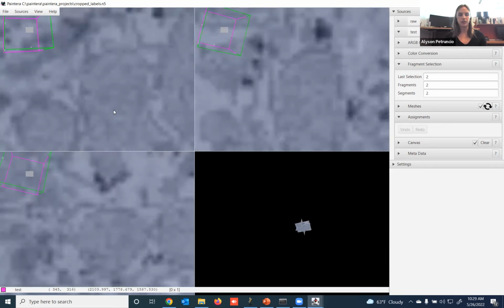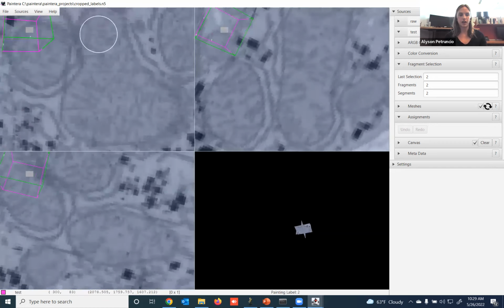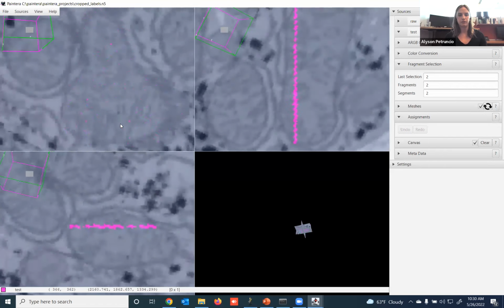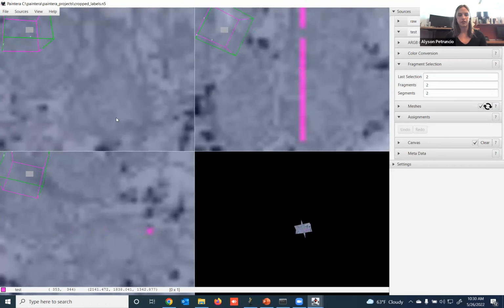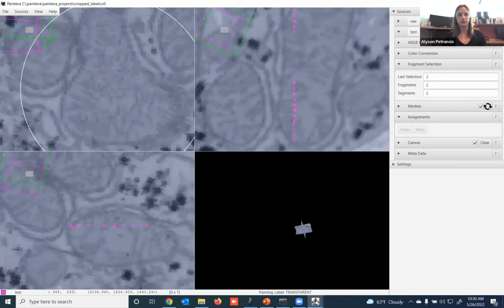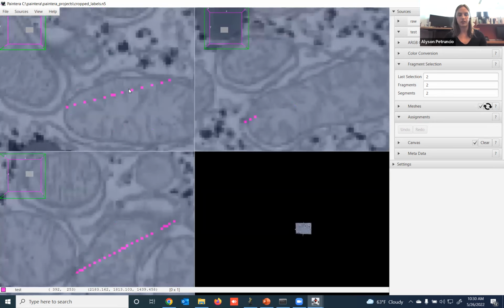And if I want to rotate and annotate in a non-orthogonal view, I can do that as well. And as you can see, the brush resolution will not adjust until I release the brush, and it will adapt to the data. Another feature that I can use here, I can select Shift-Z, and it'll reset the orthogonal planes.